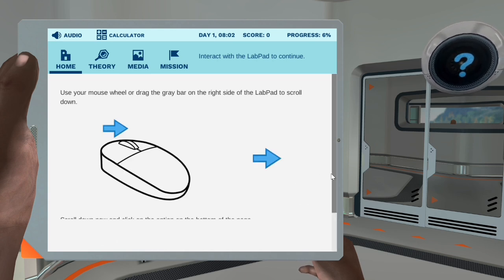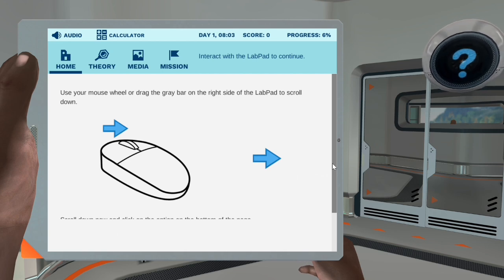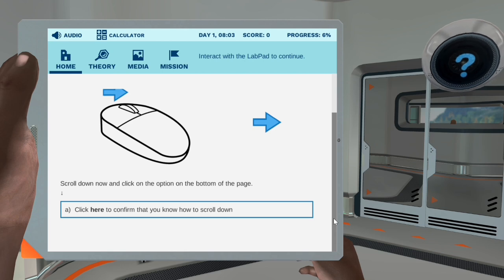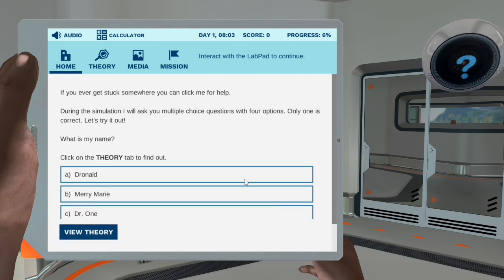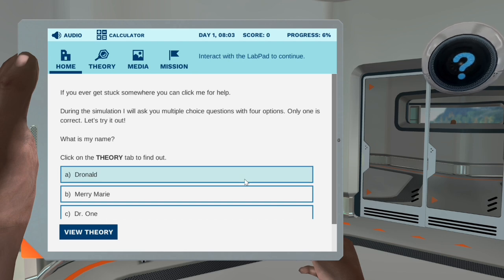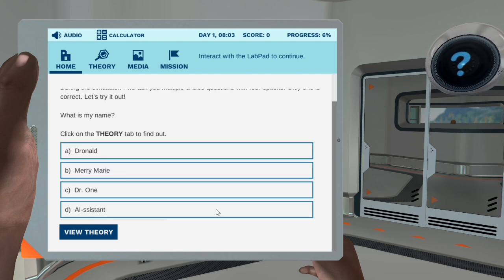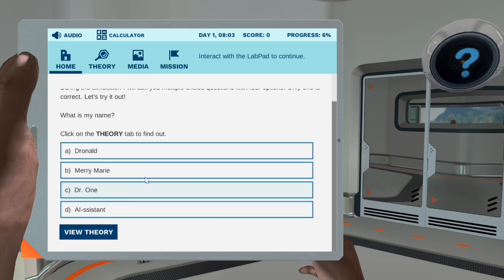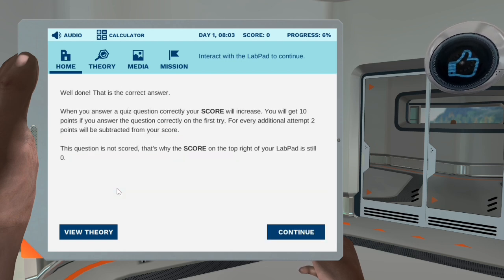Make sure you read the information in this white text box carefully — you won't be able to access it anymore after you click continue. You can access all relevant information in the four tabs above. Right now you're in the home tab. Click on the theory tab to learn about the four lab pad tabs. Use your mouse wheel or drag the gray bar on the right side of the lab pad to scroll down. Scroll down now and click on the option at the bottom of the page.